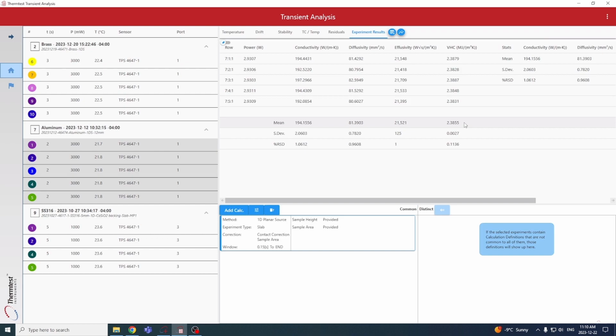1D slab is roughly polymers up to very high conductivity materials with the advantage of being able to test thinner format. So we're really excited to be able to bring this proprietary capability to the market.